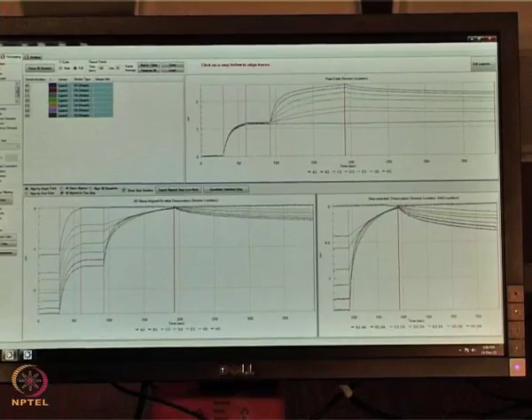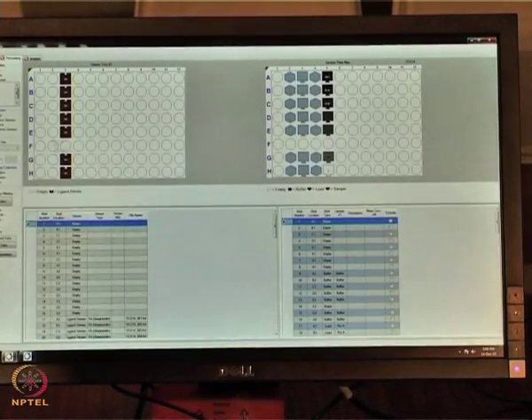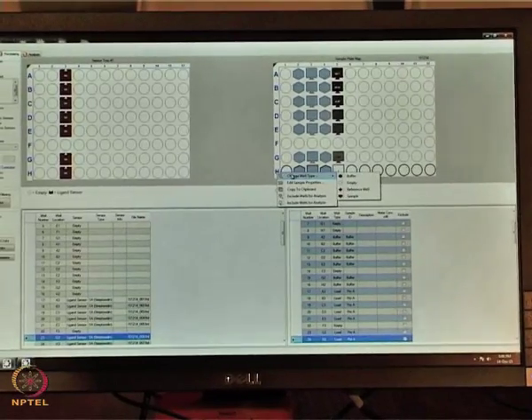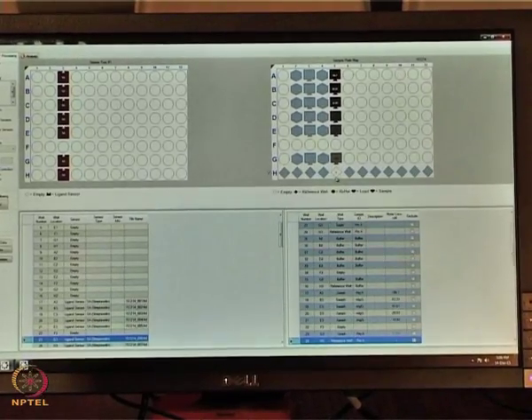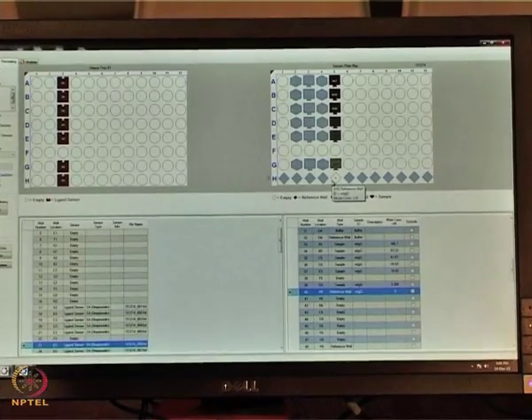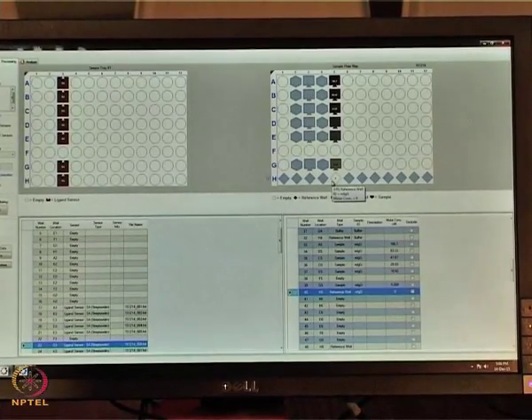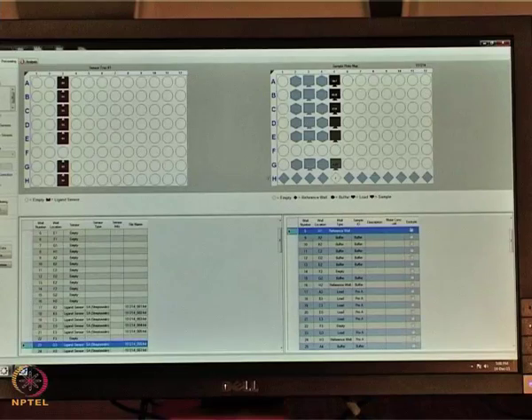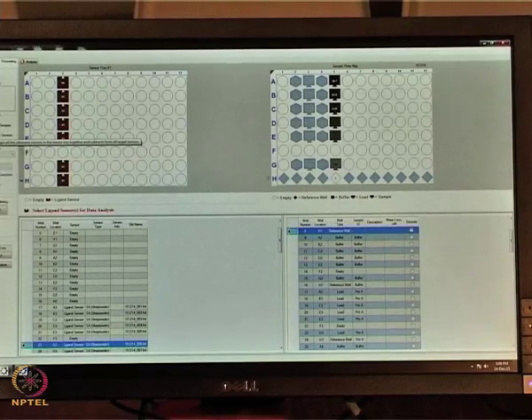So what we are doing is subtracting. I had put a 0 concentration in one of the columns. This column I will change to the reference well. This is the 0 concentration, because some of the artifacts from the buffer we can subtract from the data. So that is why I am going for the reference subtractions. On the left hand side, here we have the subtraction icon. We have different types of subtraction systems.